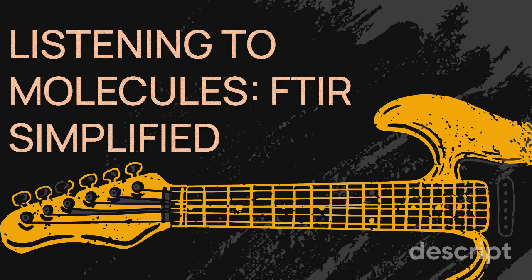Precisely. And that's what makes HD exchange so valuable for studying protein structure. It gives us a way to map out which parts of the protein are more exposed or flexible. So we've got these deuterium atoms acting like tiny beacons, revealing the protein's hidden movements. But how do we actually detect those beacons? How does FTIR help us track the HD exchange process?